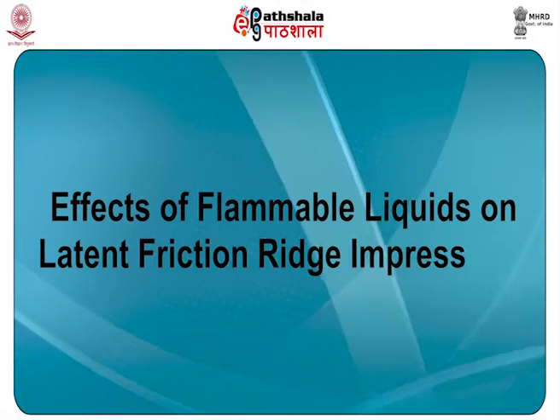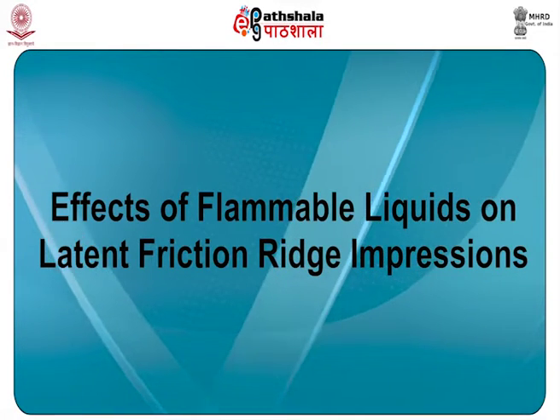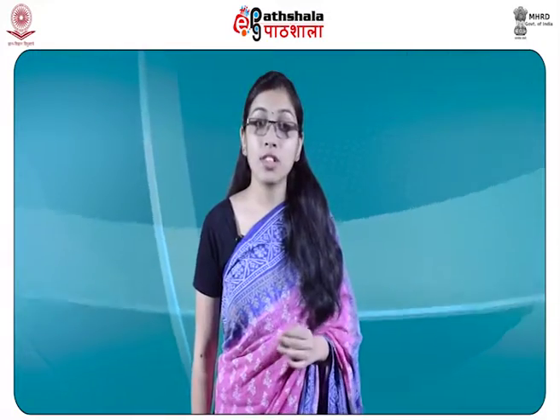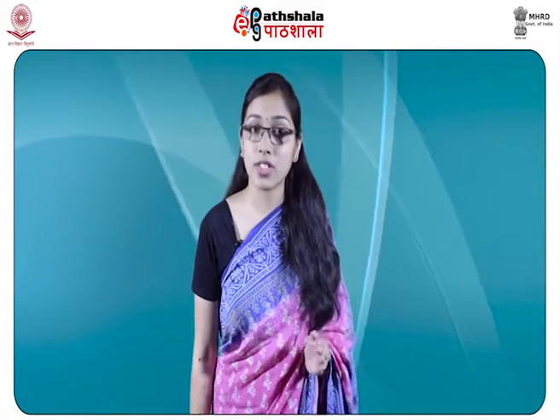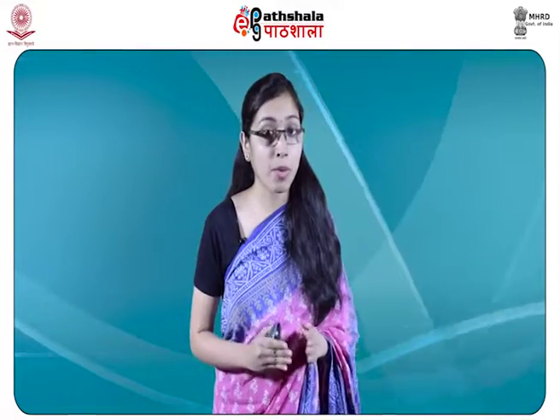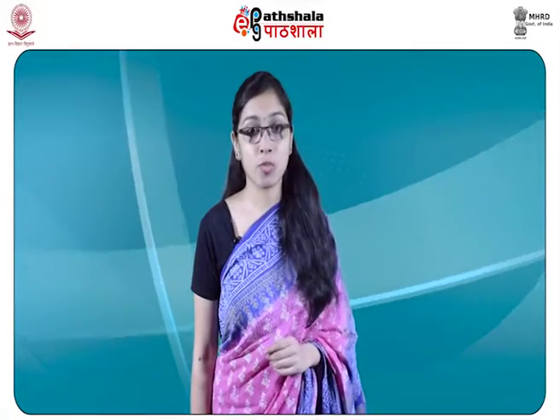Next is effects of flammable liquids on latent friction ridge impressions. The presence of flammable liquids on the surface of the substrate has been reported to decrease the effectiveness of soot removal technique. The recovery of soot developed friction ridges by water rinsing described by Vaughan was compromised by liquids such as gasoline and kerosene. As mentioned earlier also, the hydrophobic nature of these flammable liquids repels the water from the surface, impeding the soot removal.